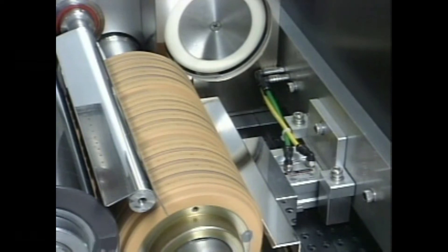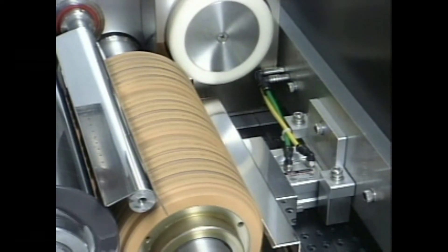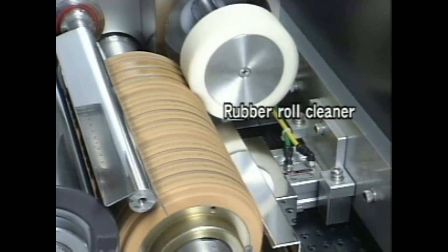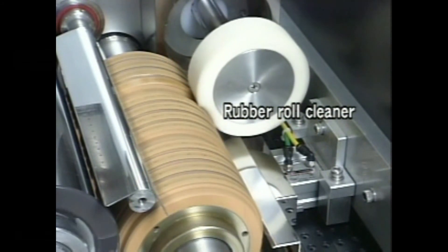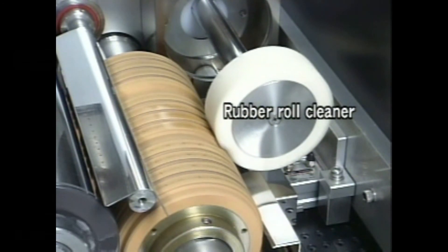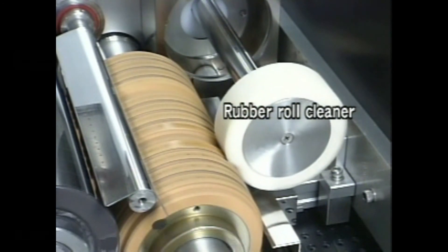Because the ink or shellac accumulates on the surface of the rubber roll, it is necessary to perform periodical cleaning. A sponge containing alcohol automatically cleans the rubber roll. Moreover, we can set a time interval for cleaning as we wish and it is also possible to control it automatically during printing inspection.